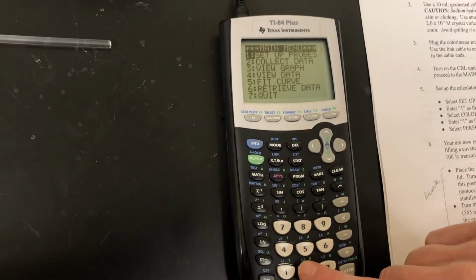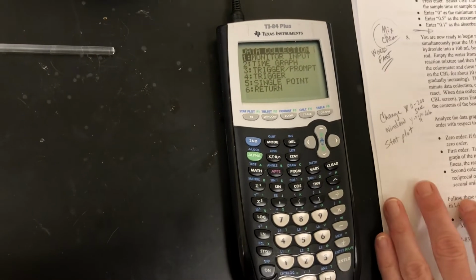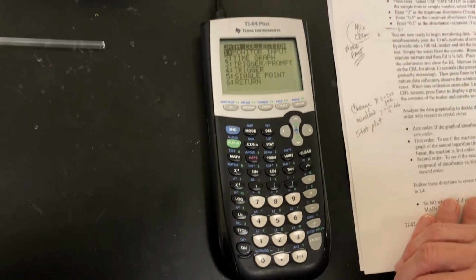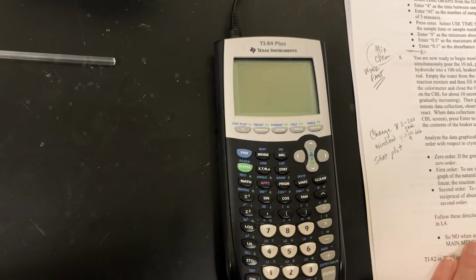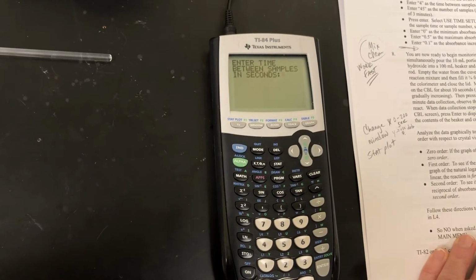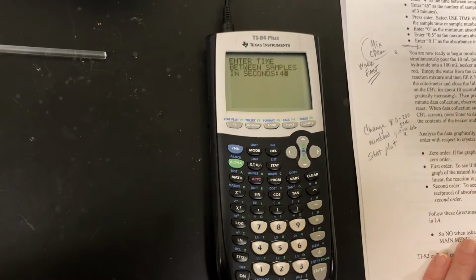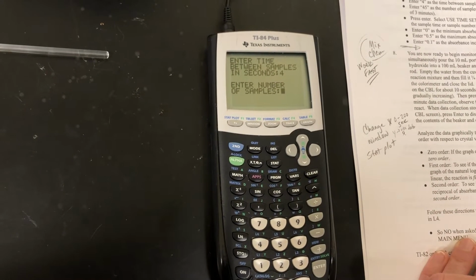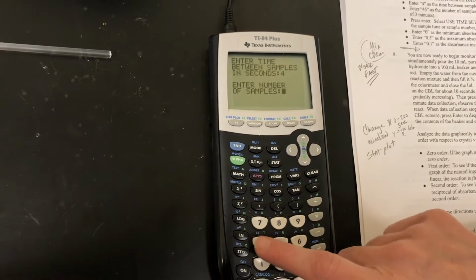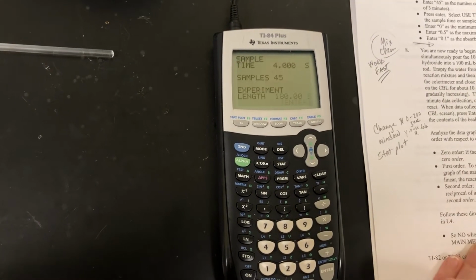So I'm going to go ahead and push 2 for collect data. I'm going to also flip over my procedure because I'm following it as I go. Okay, so they tell us we want a time graph, which is option 2. So I'm going to select that. They tell us the time between samples is 4 seconds, so it will collect data every 4 seconds, and then you hit enter. The number of samples we want is 45, and that will essentially sample it for 3 minutes is what it ends up being.